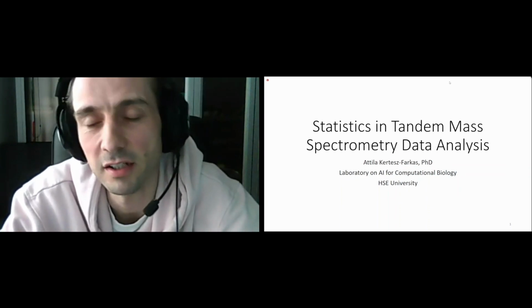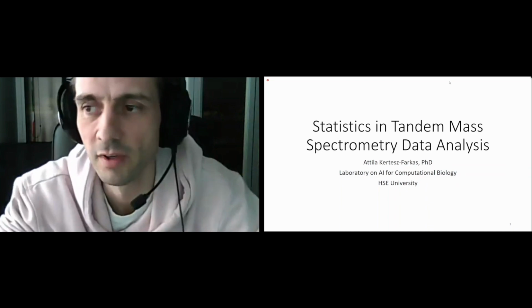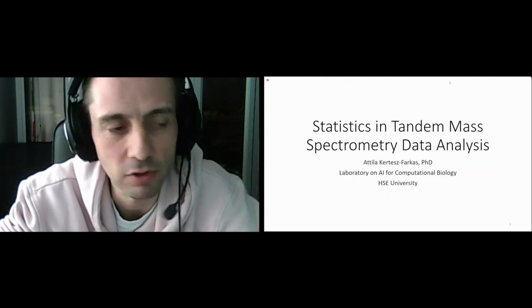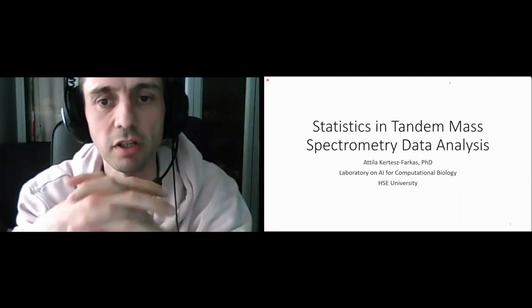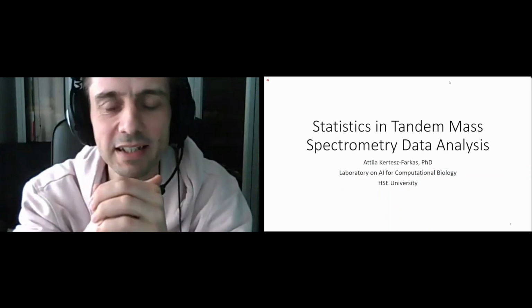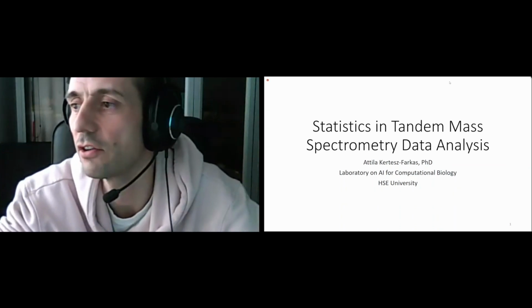But earlier, the molecules were small molecules like water or ammonia. Later, the instruments became very accurate, robust and sensitive, so they were able to analyze larger molecules, such as peptides and organic molecules. This makes the data more complex, and we need computational methods and algorithms to automatically annotate these data.